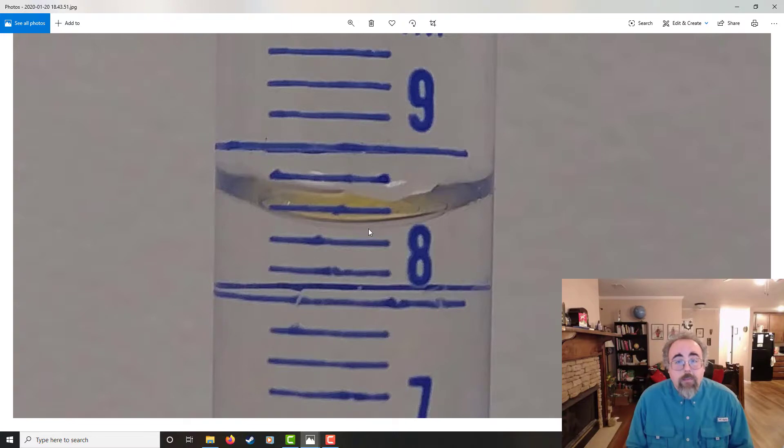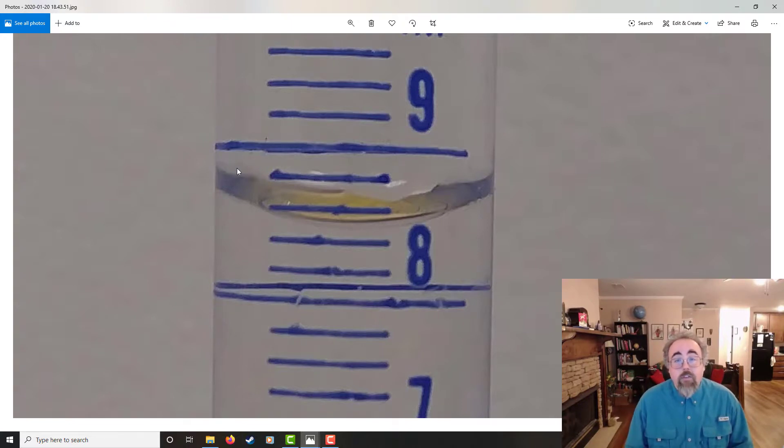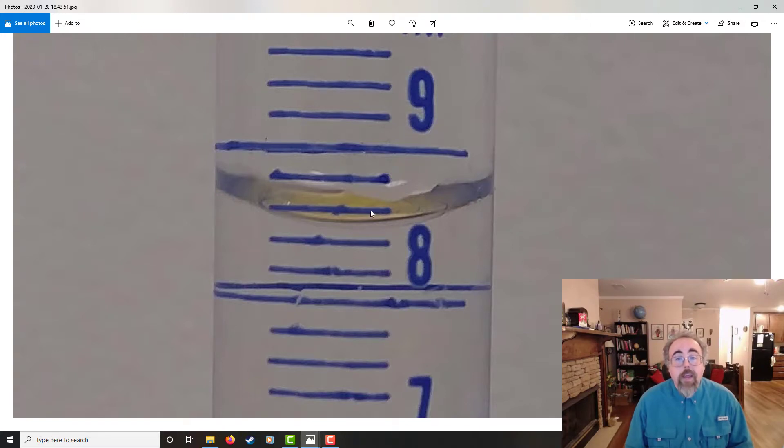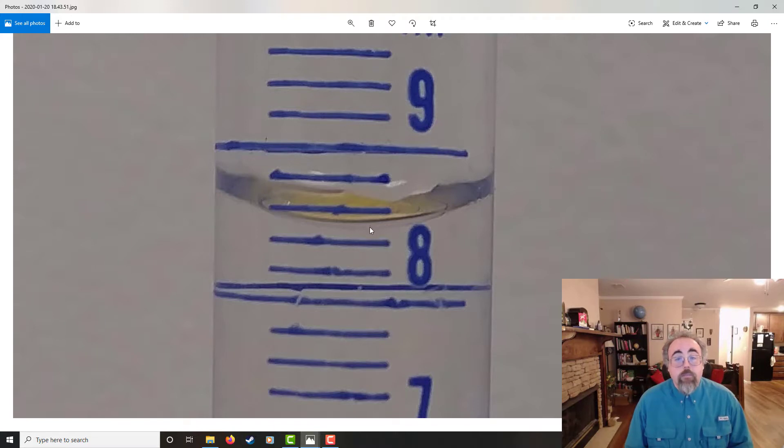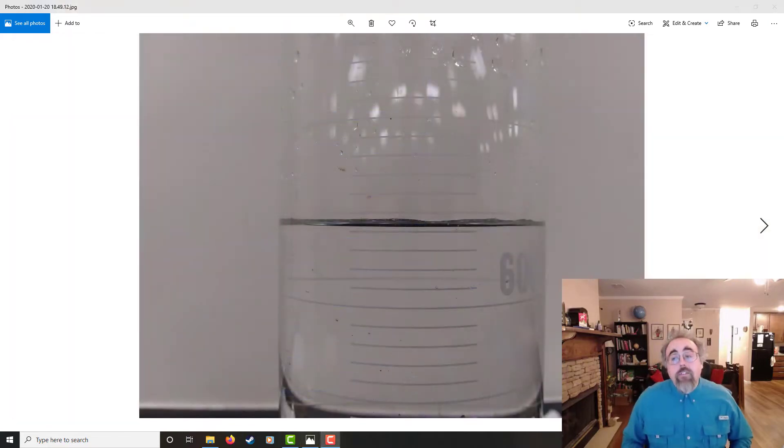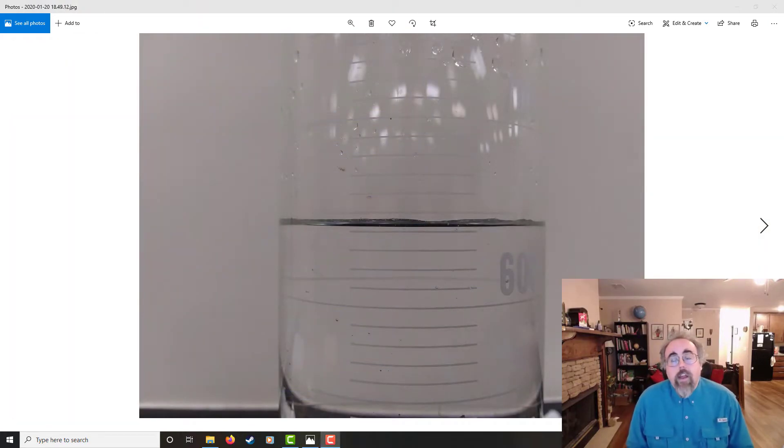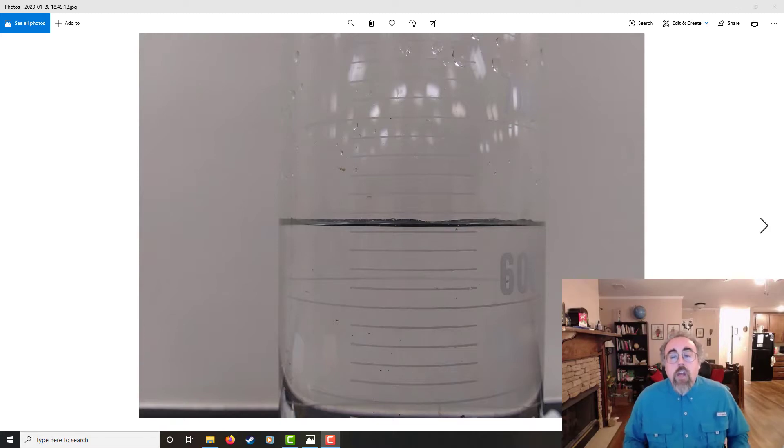Okay, so we've got this one, a couple of warning signs. Once again, make sure you pull from the bottom. Obviously, you'd be off by half a mil practically, but the meniscus is big. And the other point is, careful in those tick marks. They're not always ones. Okay, last graduated cylinder I have photos for you tonight. And this has got a little bit more going on.